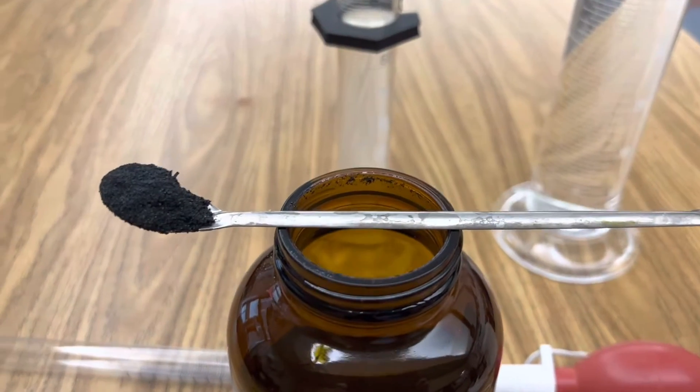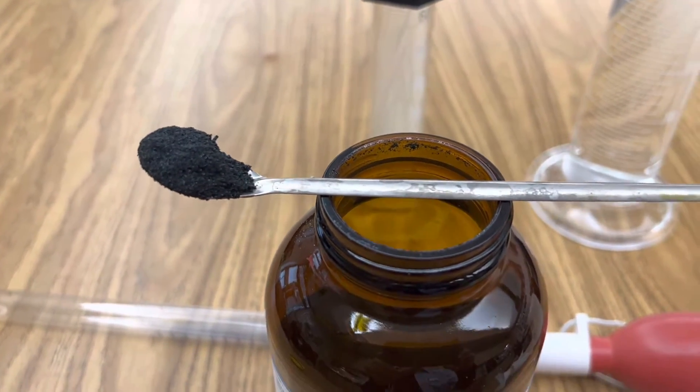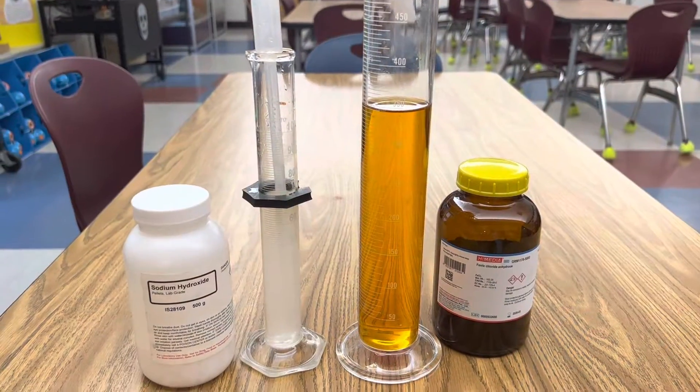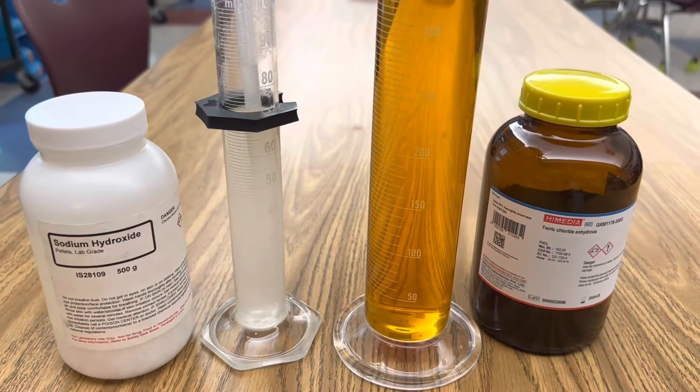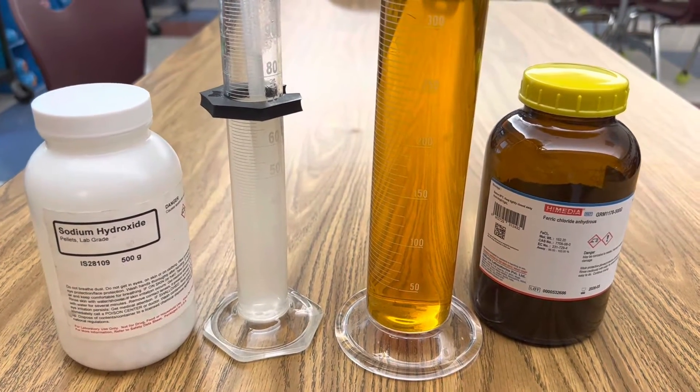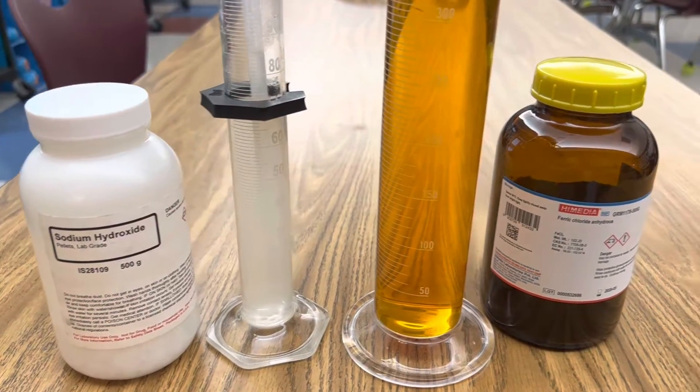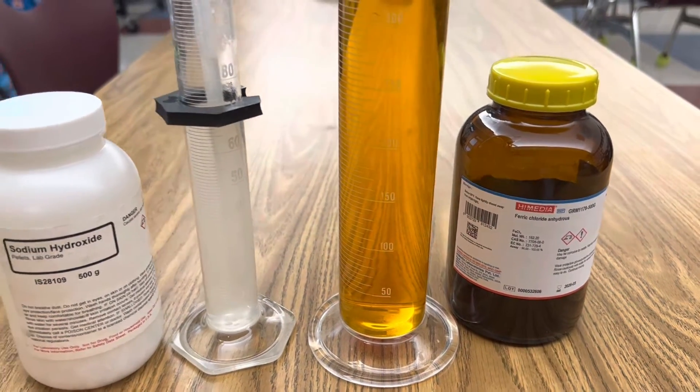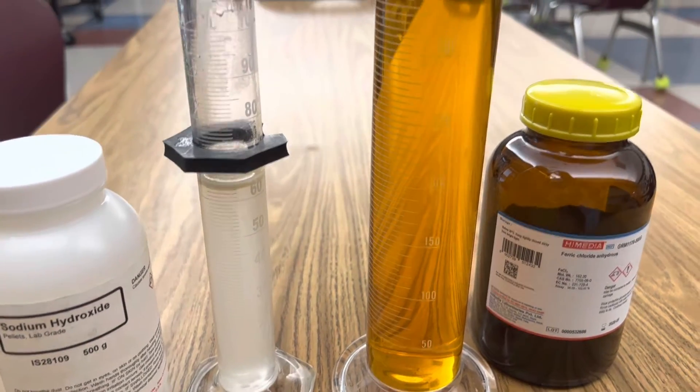Ferric chloride is also called iron chloride as the Latin name for iron is ferrum. Once both solutions are aqueous you're ready to observe the double displacement reaction of sodium hydroxide and ferric chloride. As you combine the two, sodium will trade places with iron and create the insoluble precipitant ferric hydroxide.